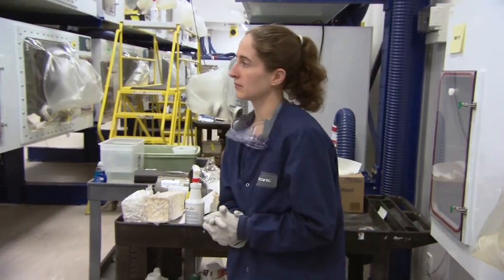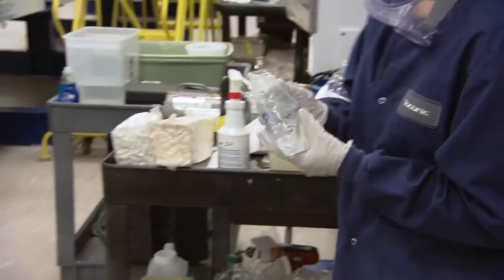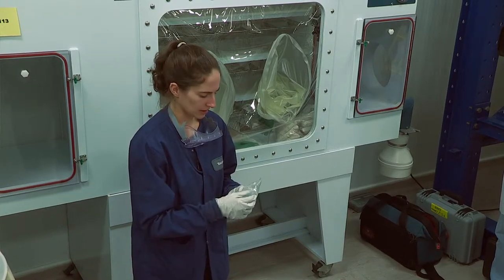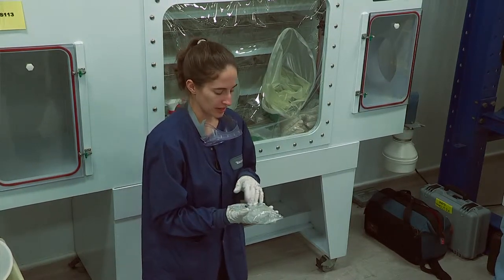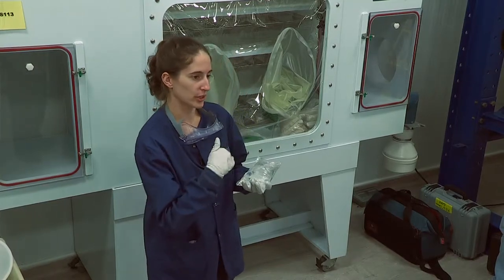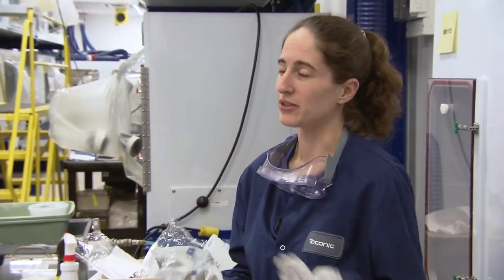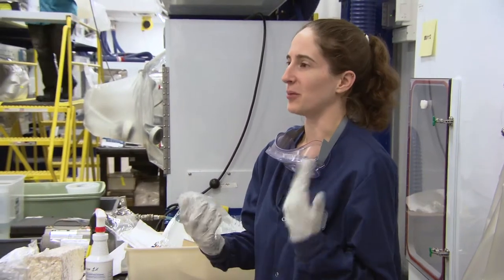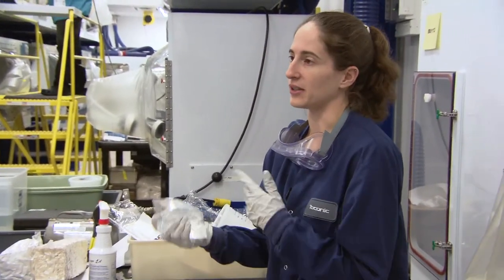Somebody asked during the presentation about the capacity of the Hydropack versus a water bottle — what does it compare to in size? We have a five per cage max. This will last five per cage a week — one week. There's 15 ounces per week. The nice thing about the Hydropack is you can let it go down pretty low before you have to change it out. If you have a breeding trio and two moms with litters, you might find yourself changing it at four or five days, but for the most part this will last a full week. There's a little bit of training involved to get them applied correctly without popping or leaking, but once you know how to do it — as they say, it's all in the wrist.